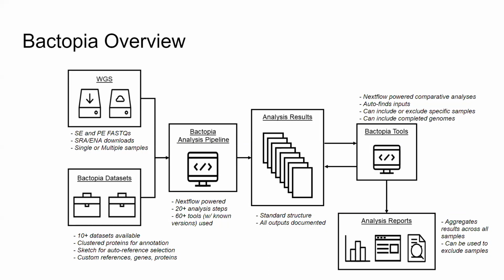me personally, I don't want to figure out where your data is. I want you to tell me where it's at. I did create a tool for that, Bactopia Prepare, where you give a directory and run Bactopia Prepare, and it will create this file of file names for you, with hard-coded paths. That way it's easy to find stuff, and nobody's trying to figure out where the data is.